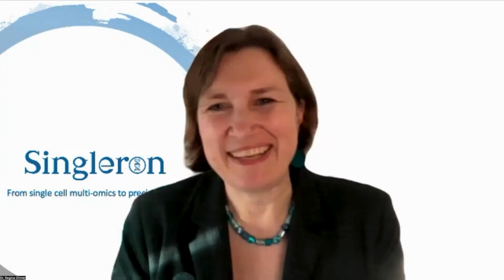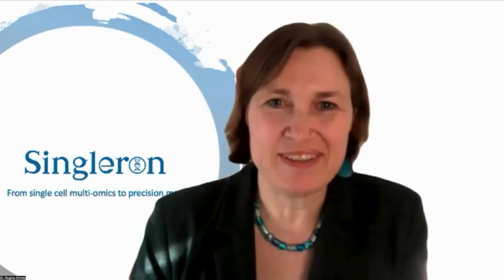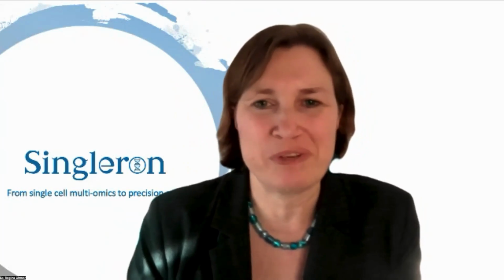Yeah, thanks, Regina. We are still very good with time, so I will go ahead with two more questions. Can I get more information on product options, licenses, and pricing? Also very important. Yeah, sure. We will answer all those questions one by one, depending on the needs of the person requesting.